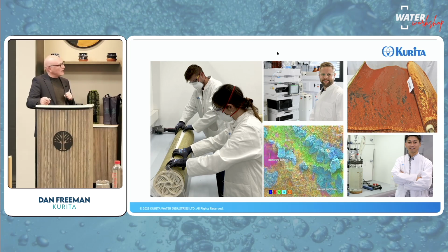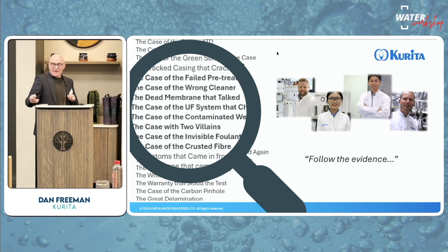If you use a standard SEM image, it's a black and white image, it can usually tell you what elements are there, but we can't understand exactly how they're distributed. So one of the real benefits of that process is to understand how those are distributed. And in some cases, you can see different layers of distribution, so you can understand that there's been more than one event that's caused a problem. So what I'm going to do today then is go through a few of our autopsies, take a few cases from our list of autopsies and explain how we go through this process and some of the benefits of it.